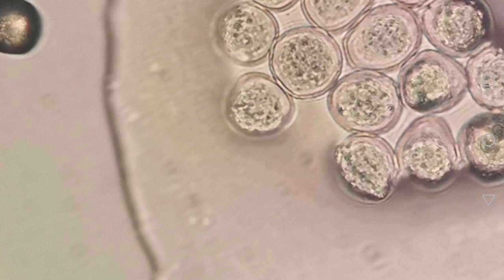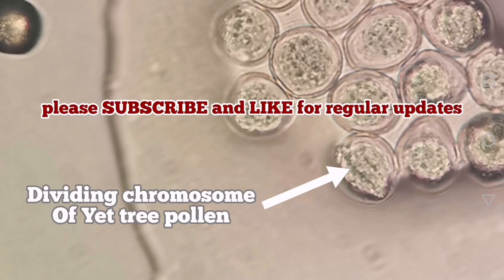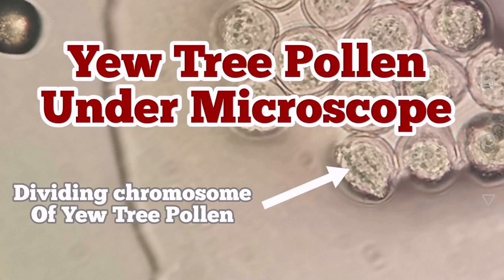That is the reason the pollens are so numerous, because they are dividing all the time. And because of the number of them, they cause interaction with our noses and lungs, and cause allergic reactions in us. This is one of the ways that they actually do this, by sheer number.